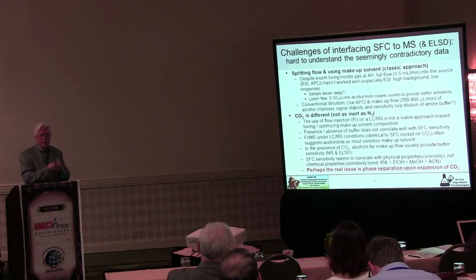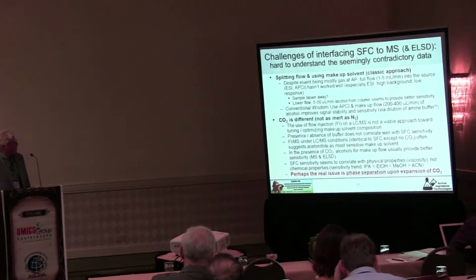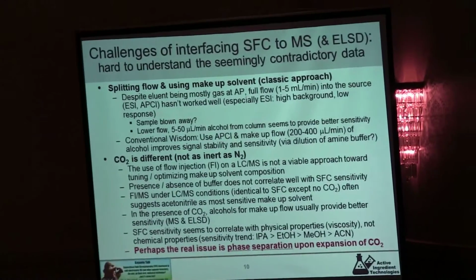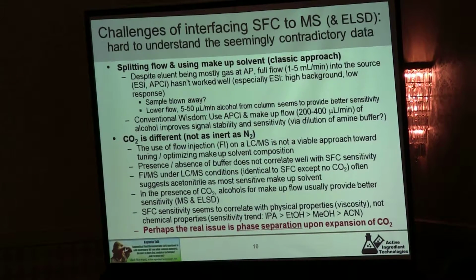What we knew with mass spec, the lower the viscosity of the solvent leads to the availability of more ions, just because you get a better aerosol as you're spraying it into the mass spec. But what we saw when we do this with SFC is that instead of lower viscosity working better, seems like higher viscosity works better. Wasn't making sense to us. It was just the opposite of what years of experience of doing LC-MS had taught us. So this led us to a different hypothesis, and that the real issue with detection is phase separation when the CO2 expands.